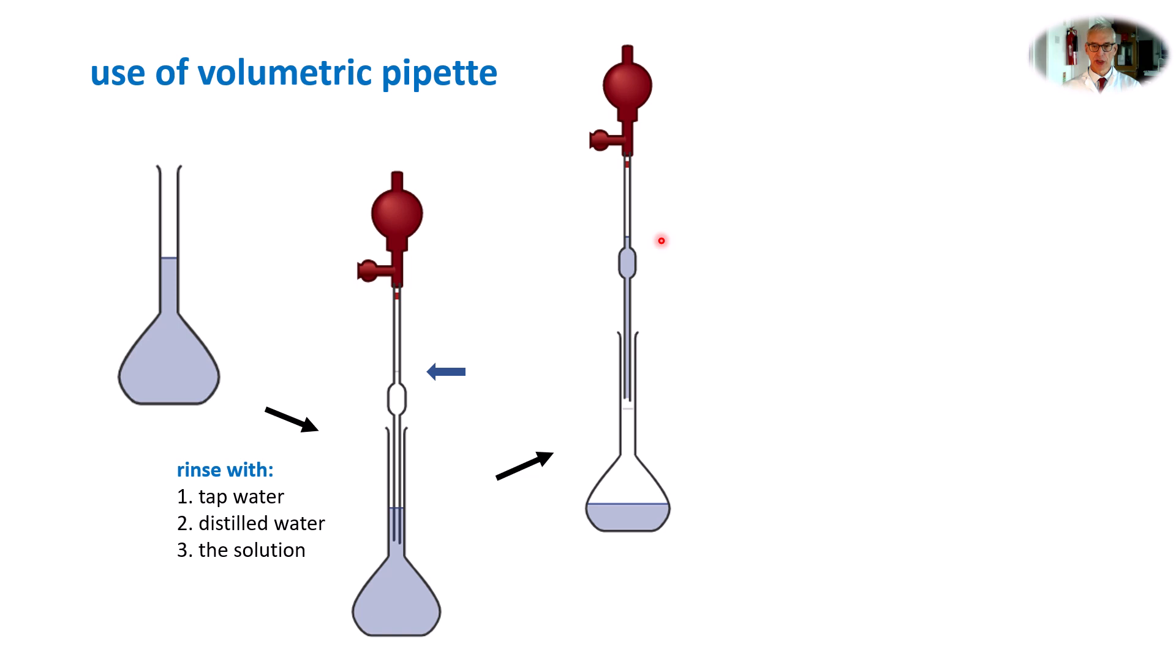Having filled the pipette to the graduation mark, you then remove from the standard flask and transfer a short distance to a conical flask, a clean conical flask. Make sure that the conical flask is close to your volumetric flask and you're not transferring any distance because we don't want any drops or any loss of solution from the pipette. My recommendation is that you remove the pipette filler and allow the pipette to drain.